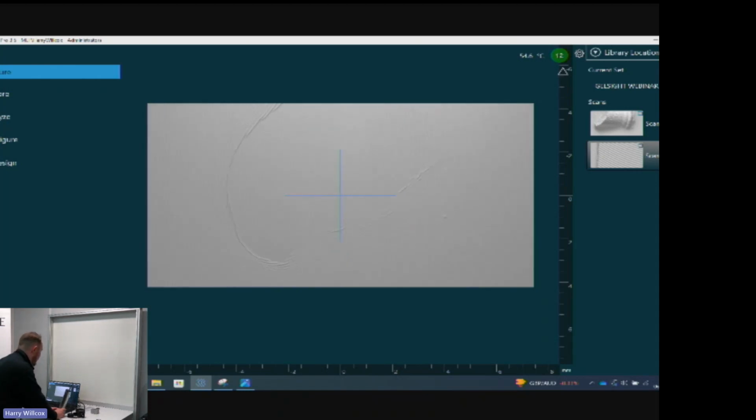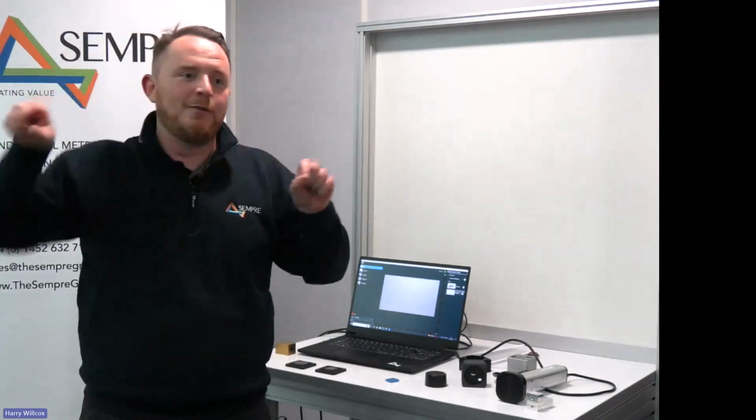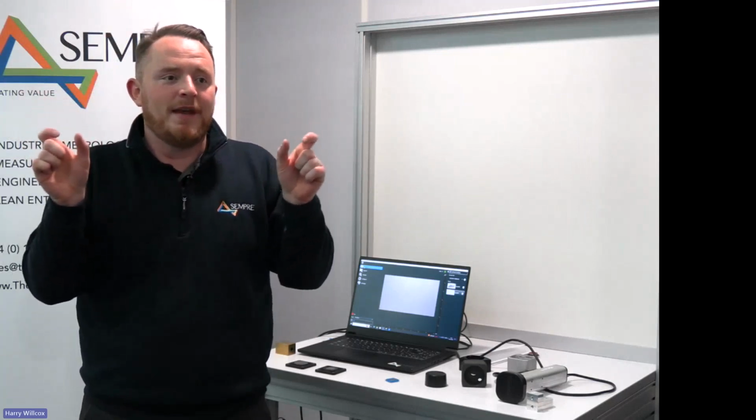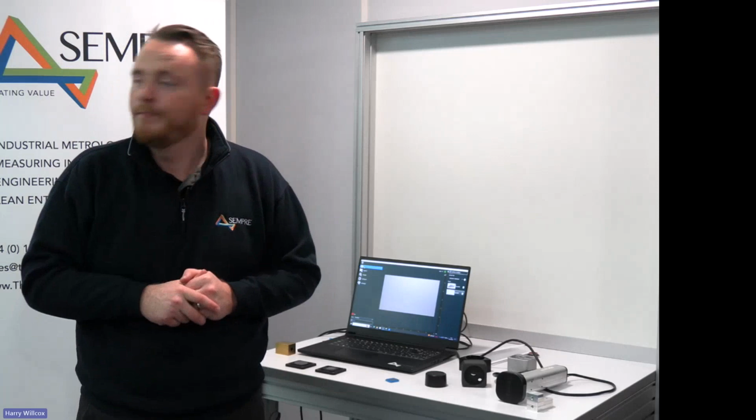Now, if I was to apply too much pressure to the point where we were going to effectively rip the pad or break the pad, then that's another element. But I don't tend to see a difference between the measurements, whether I was to apply a slight bit of pressure or I was to apply too much pressure. There's sort of a boundary. It's sort of that sine wave, really. Either side of it, the 10% either side, the measurement's been done incorrectly, but in that middle boundary, we don't tend to see a deviation to the results that we see. Okay.